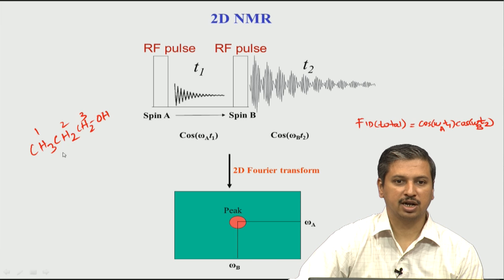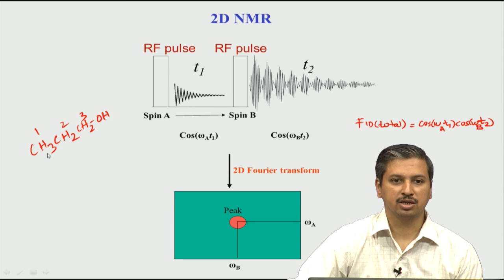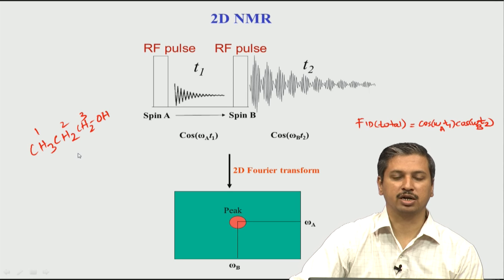When I am considering this as an active pair, I have to see that this other pair is now draining away the magnetization. Similarly, if I consider these two as an active pair, magnetization is getting drawn away from this. So, this magnetization is getting divided, and its efficiency of transfer to this or this is reduced. But if you consider these two hydrogens, 1 and 3, they are only coupled to 2. So, for them you can have a very good efficiency because they are unidirectional. Unidirectional means they are only going to this side, there is no other spin taking away the magnetization.